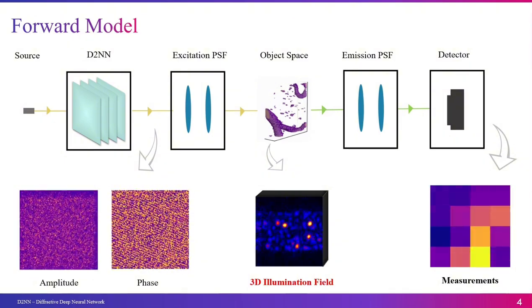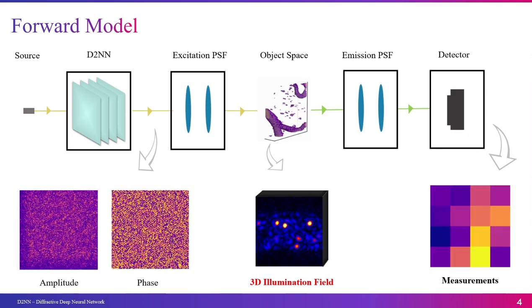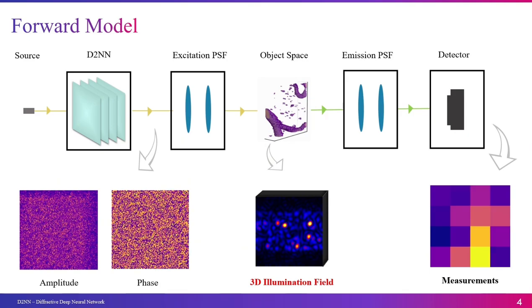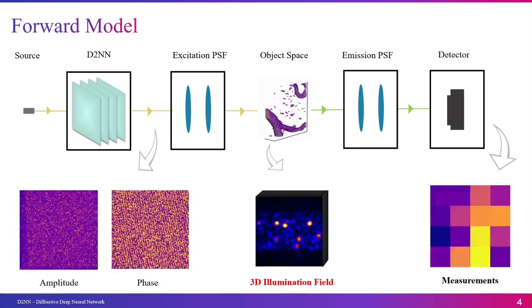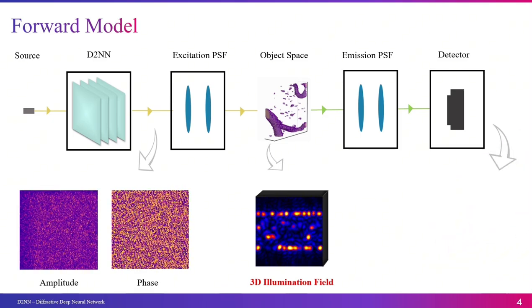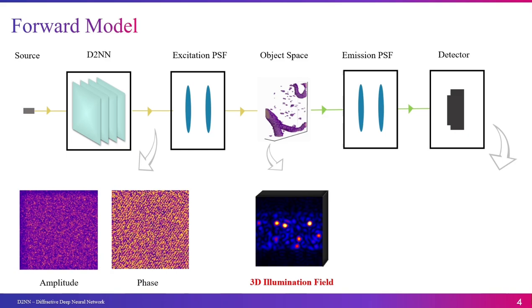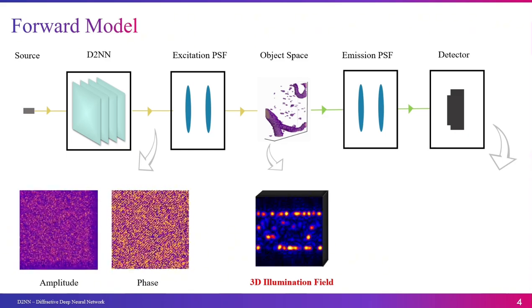By changing the DMD patterns, we effectively take multiple snapshots from various angles or depths. Despite working with a 3D object, the detector captures only a 2D image from the middle plane at each step. Therefore, a series of measurements with different DMD patterns is necessary to gather sufficient information for reconstructing the entire 3D structure. Each 2D image provides new data, and the structured illumination encodes depth information, capturing details from different planes.